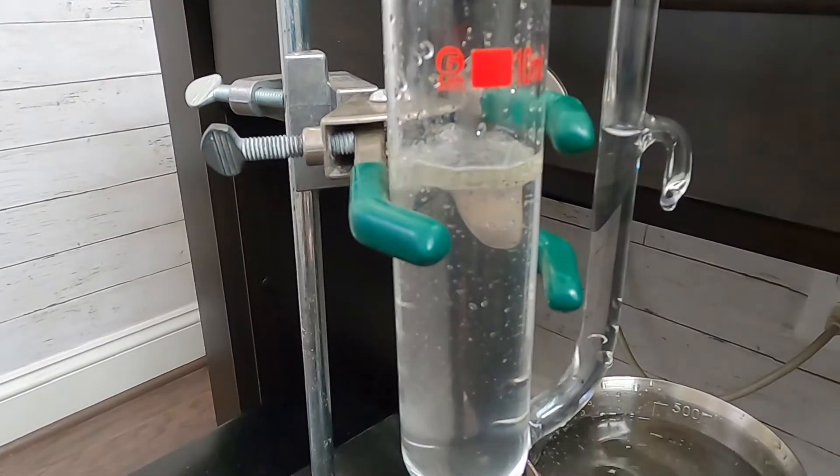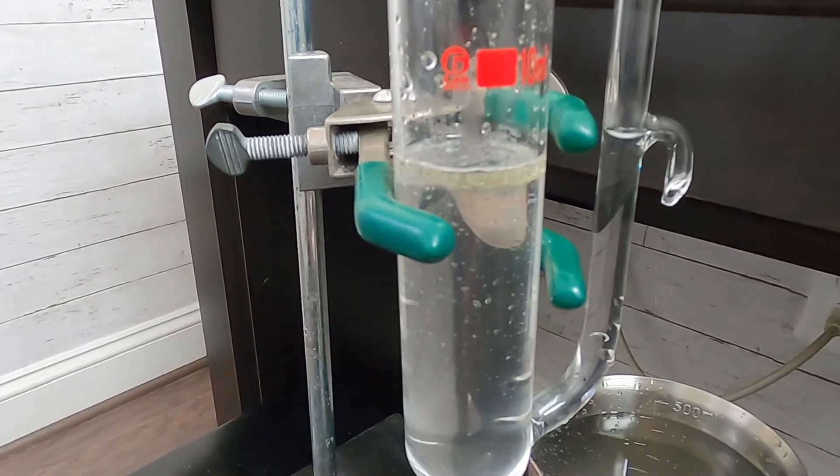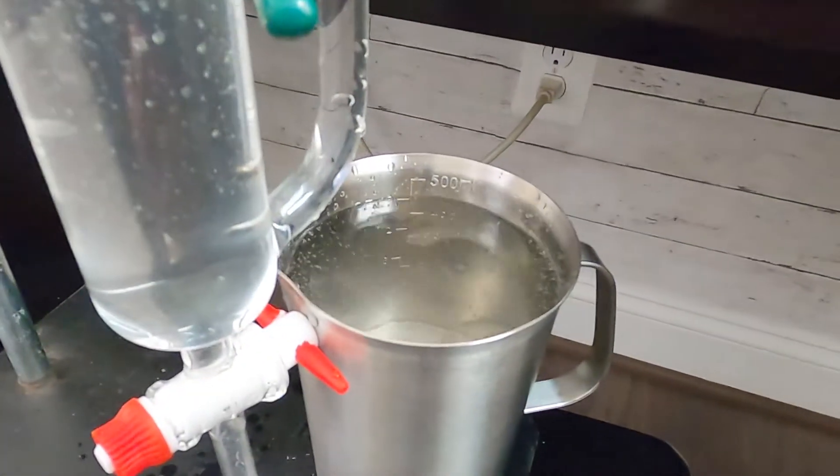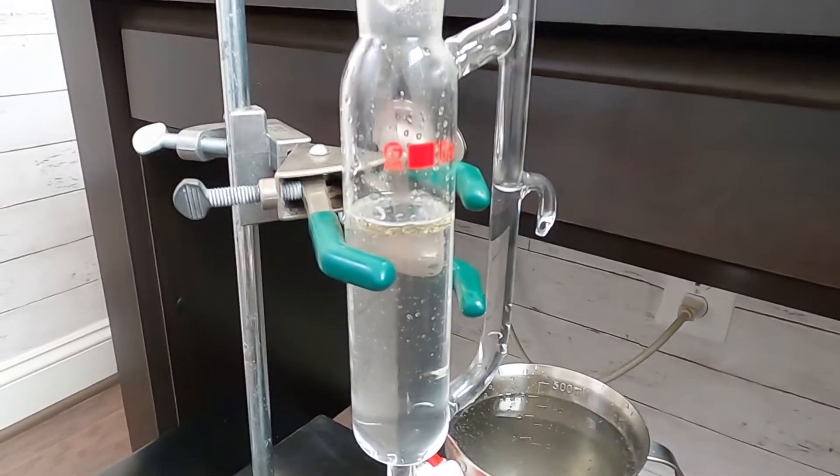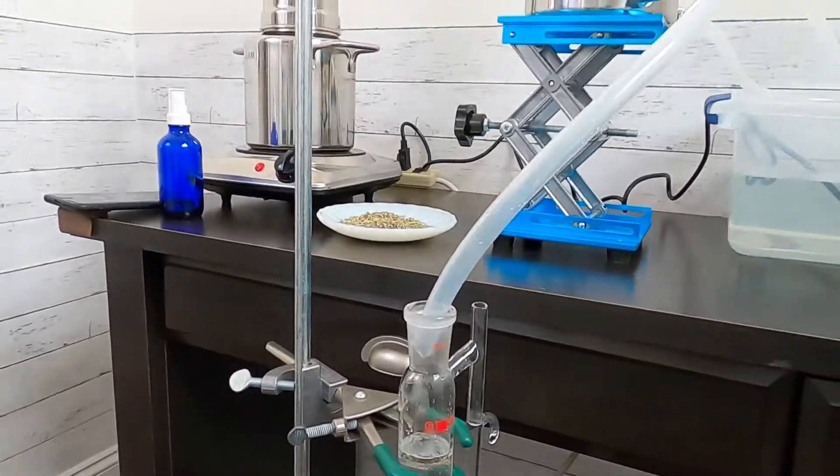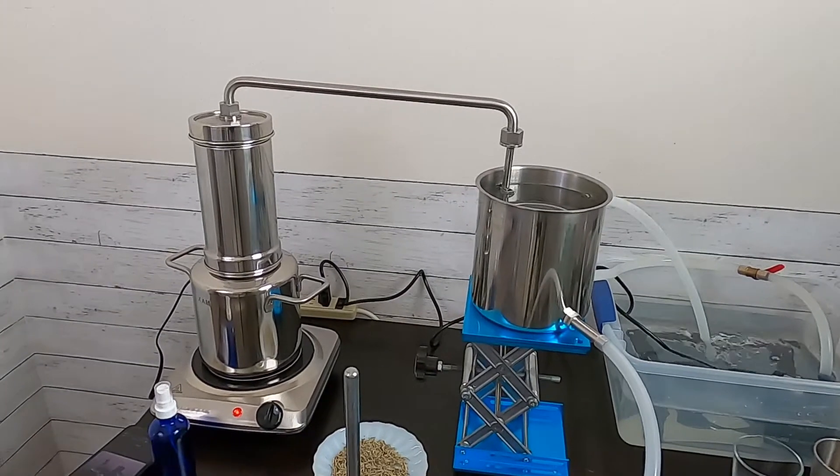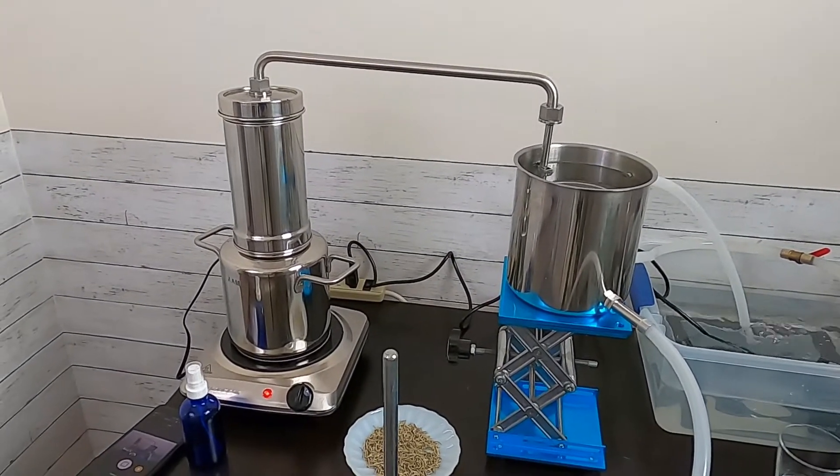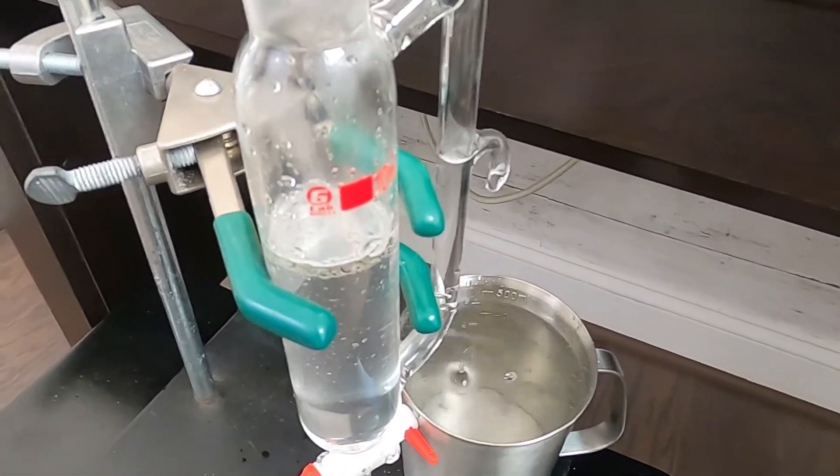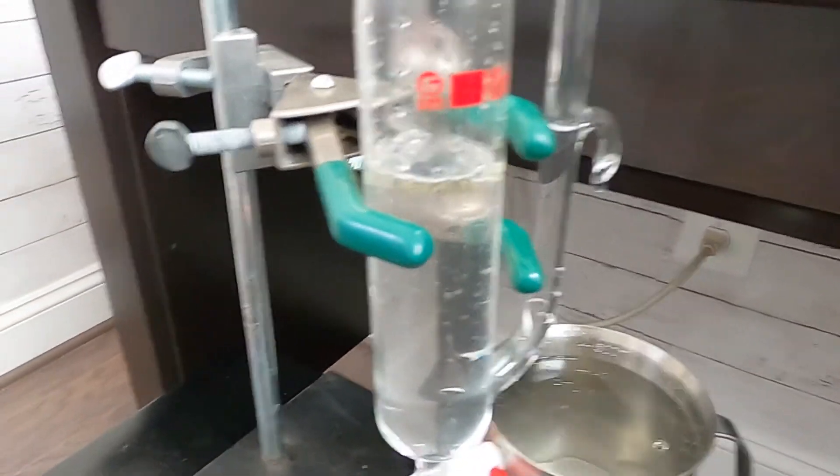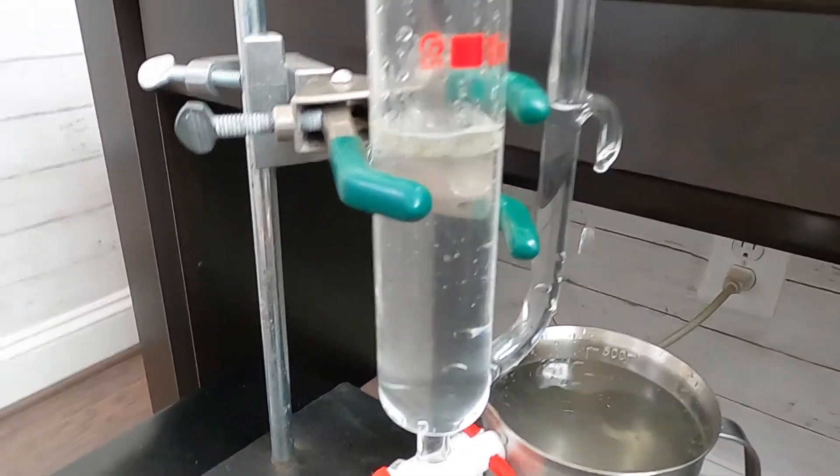You see we're getting close to 500 milliliter of the hydrosol. Normally rosemary, the yield of the oil, I mean the content of the oil, is about one or two percent. So we use 240 grams, so it's about four to four point five milliliter oil. It's pretty good.